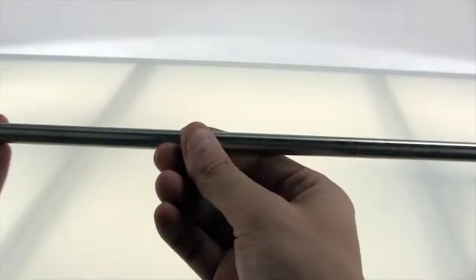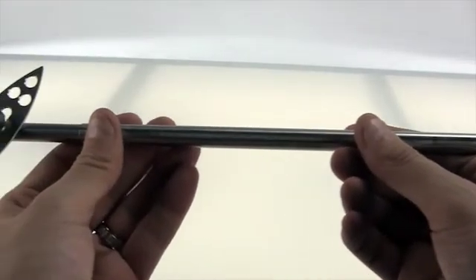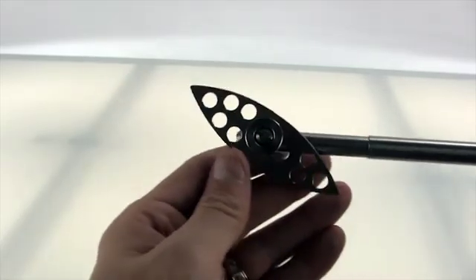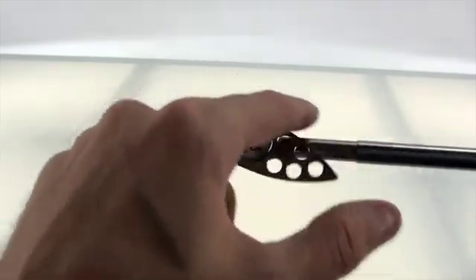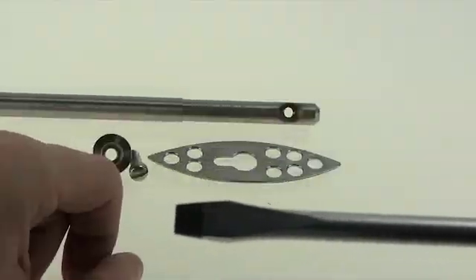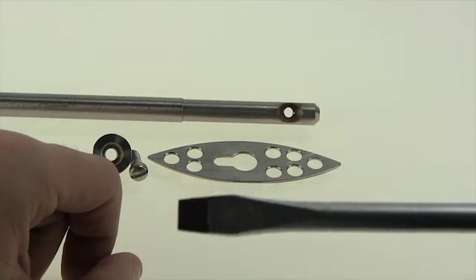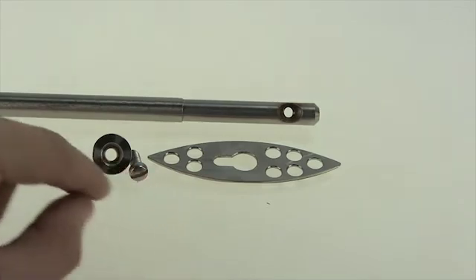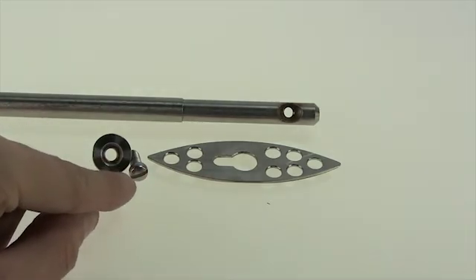Sticking with stainless steel, here we have another stainless steel stir shaft. This one has an oval or football style stainless steel agitator. For this one we will need a flat head screwdriver. In front of us we have the agitator, a flat head screw, and a button.